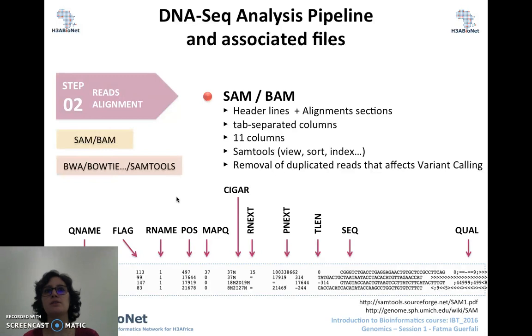So be careful, because in these kinds of file formats, redundant sequences, like duplicate reads, can be flagged, marked, and removed from the files. They represent multiple reads that are aligning to the same unique DNA fragment. These could possibly be amplified by PCR during the sequencing workflow, and this could induce a lot of errors. So it is critical to identify and remove these duplicate reads prior to variant calling. This is an important step called marking duplicates at this stage.